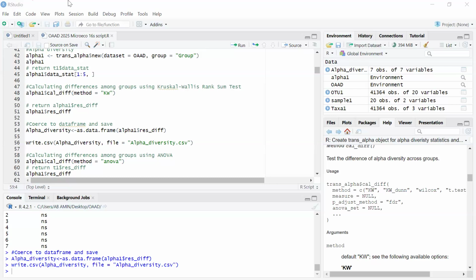Okay. All right. So if they have, please can you run the data to where he is now, because I don't think he has done much, so we can just continue from there. Well, you can run the script where we are now, then we can continue. Doctor, I think you can come back and then continue.